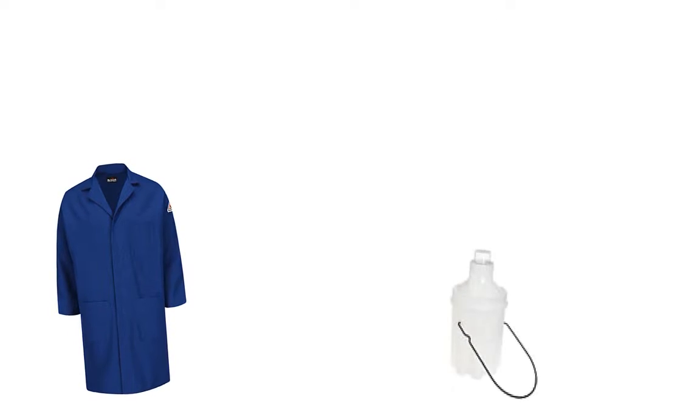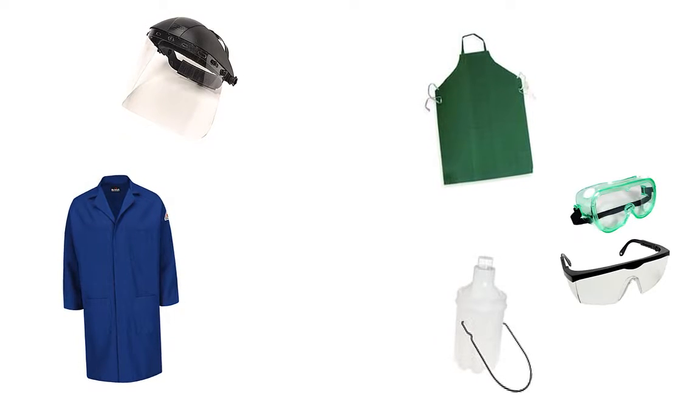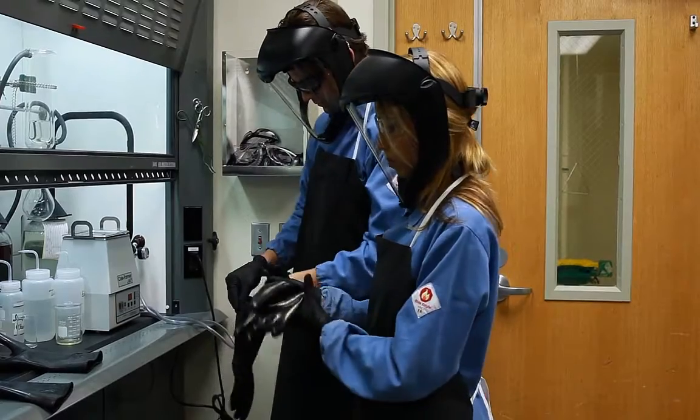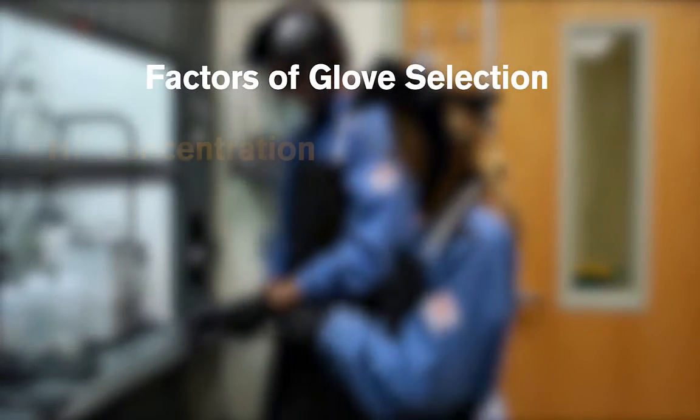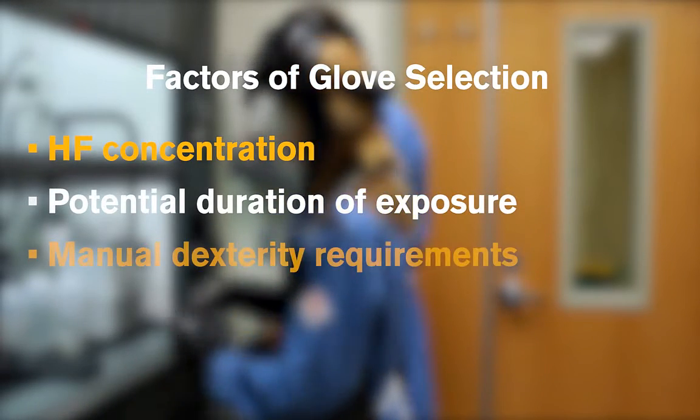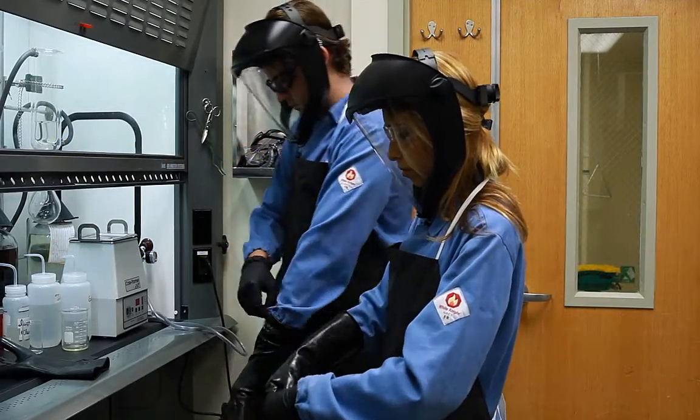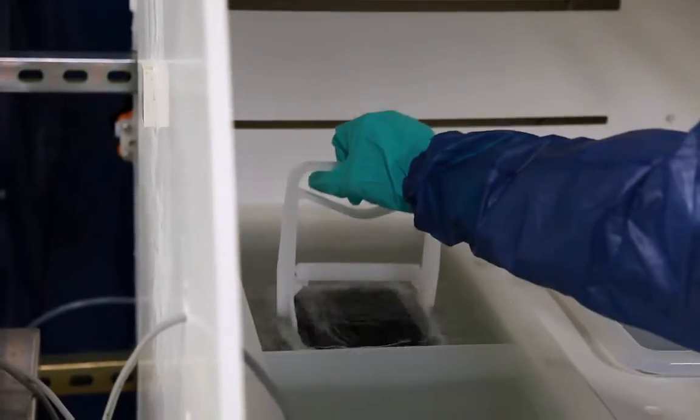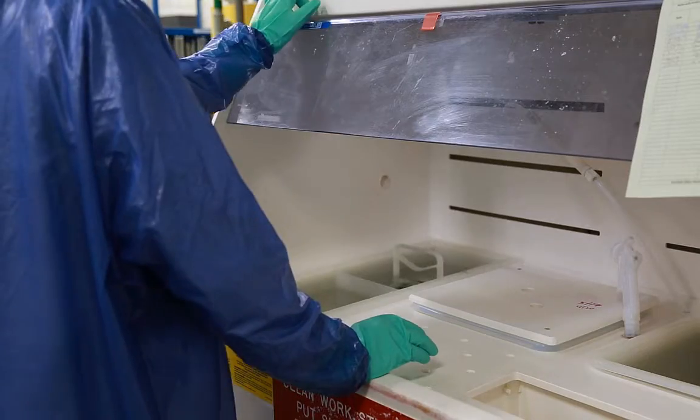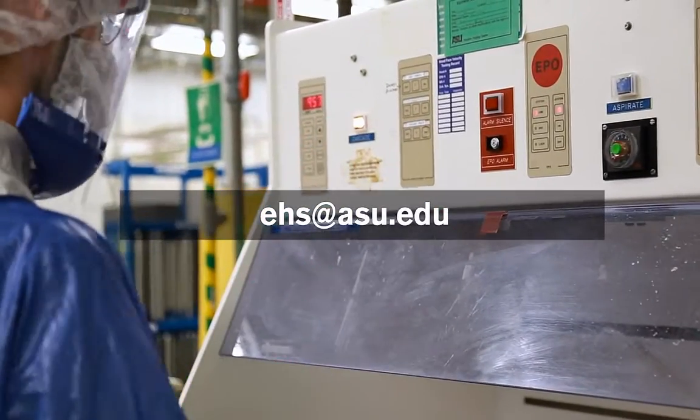It is important to make sure your PPE completely protects you from a potential HF exposure at all times. This is particularly applicable when it comes to protecting your hands and wrists. Factors to consider in glove selection are the HF concentration, the potential duration of exposure, and the manual dexterity requirements. We highly recommend you check your SOP for appropriate glove selection. If additional information is needed, contact the glove manufacturer regarding your glove preference. If still unsure of glove selection, contact EH&S at ehns at asu.edu.